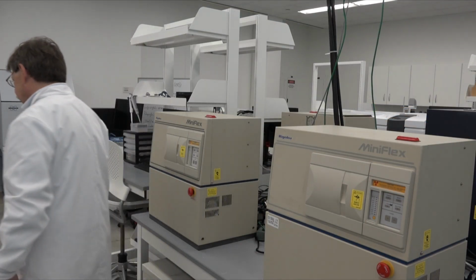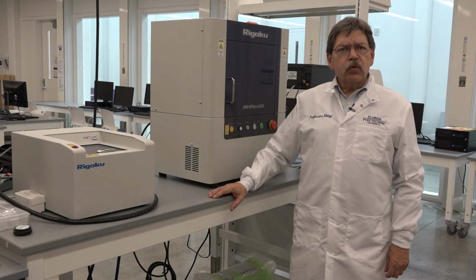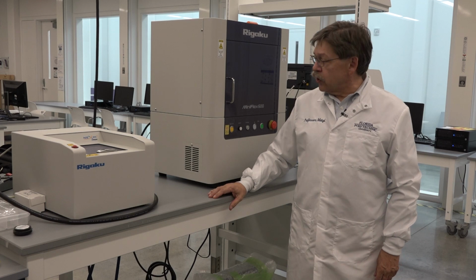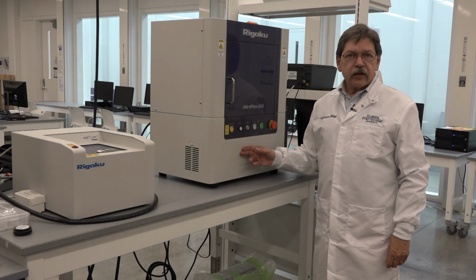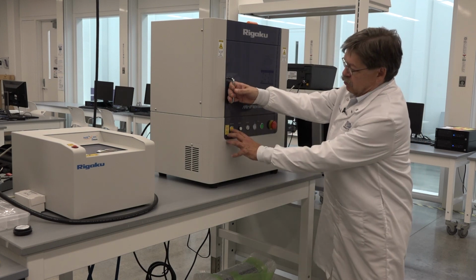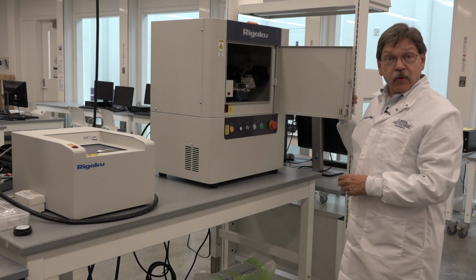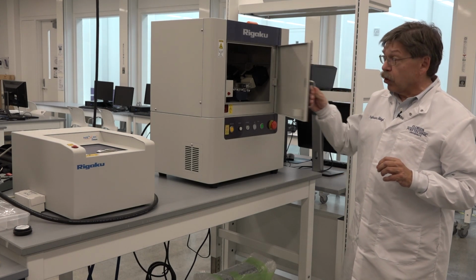Let's go take a look at the rest of our installation. Okay, I'm with 2 other instruments that are part of our installation. The first of these is another Rigaku Miniflex. However, this one is brand new. It has a number of little technical changes that improve its performance.